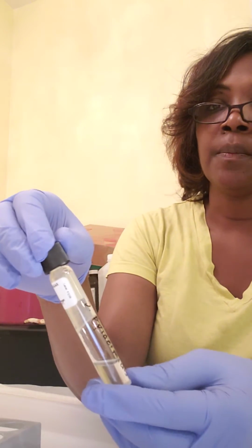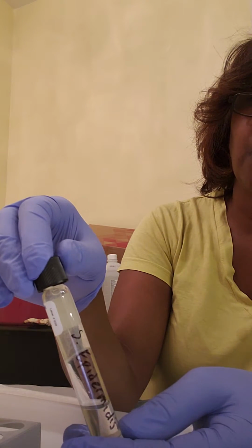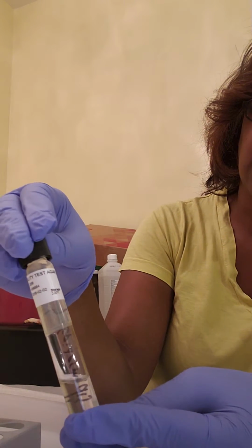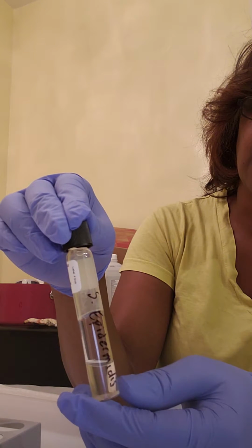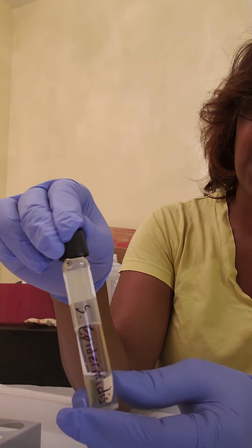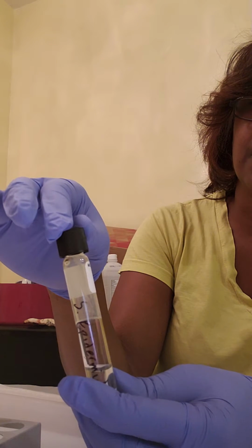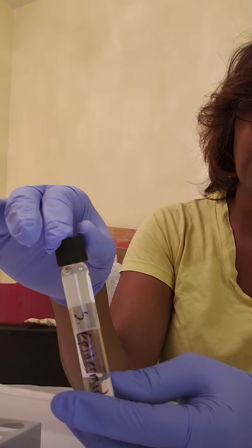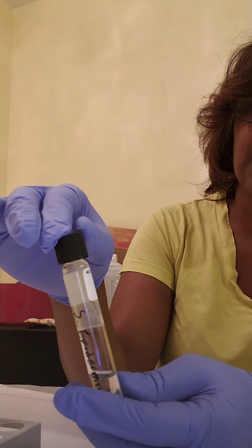This one here, there is bacteria growth throughout the gel. You can tell there's a little bit of turbidity in there. And also, if I move it slowly, it's not just a straight stab motion, just a straight line. There's a little bit more growth. So I will go over that slowly so you can see.